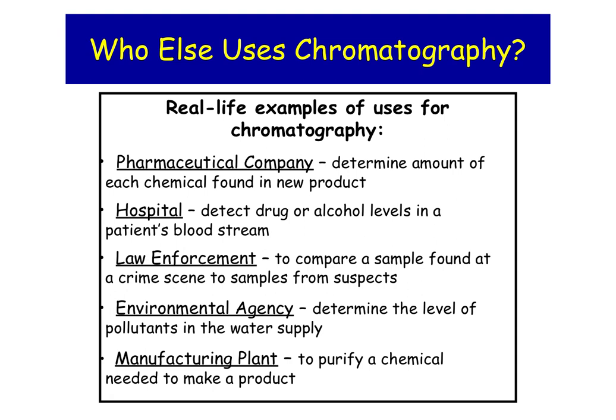Pharmaceuticals. If I'm trying to create a new medicine or a new drug, I want to make sure I know exactly how much is in that product before I give it to the next step of testing or allow a human to consume it. So chromatography can be really useful for quantifying how much medication is in something. Chromatography is used in hospitals to do blood and alcohol testing. Law enforcement will use chromatography to analyze some kind of sample.